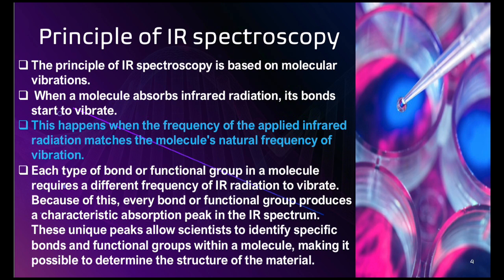Principle of IR spectroscopy. The principle of IR spectroscopy is based on molecular vibrations. When a molecule absorbs infrared radiation, its bonds start to vibrate. This happens when the frequency of the applied infrared radiation matches the molecule's natural frequency of vibration.